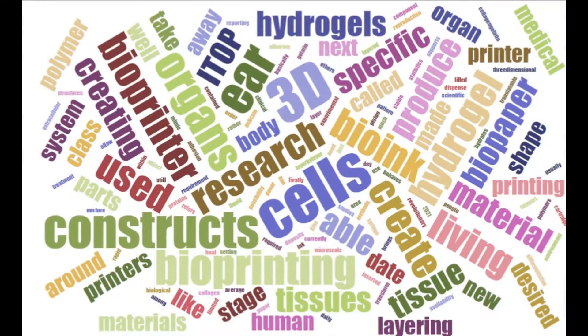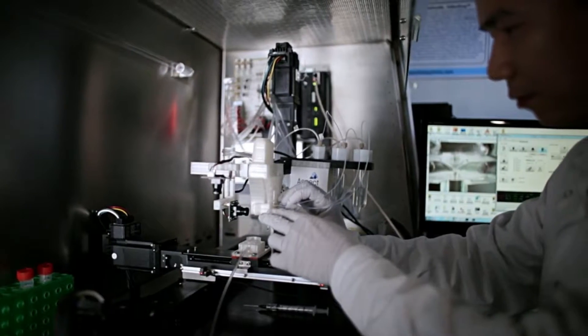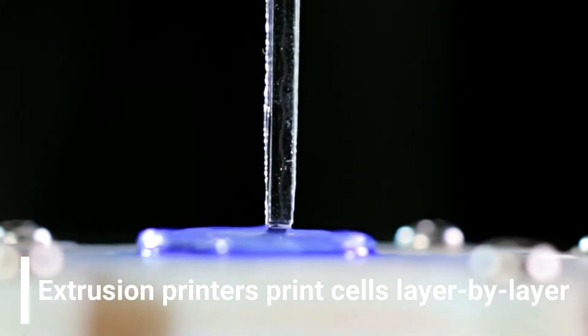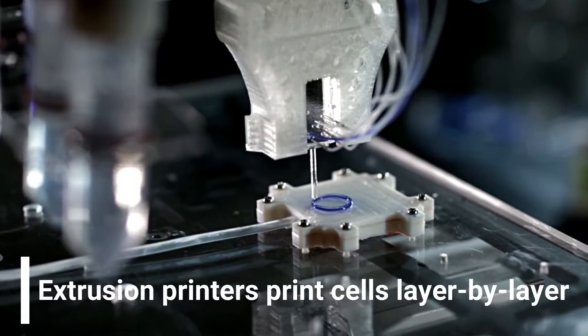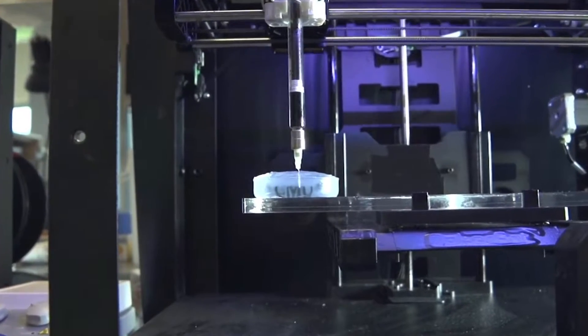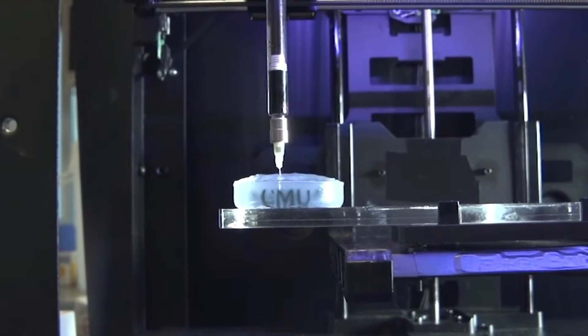There are three things that researchers need to be able to bioprint body parts. Firstly, a bioprinter is required. This is basically a 3D printer that deposits living cells in the desired pattern. A specific class, called extrusion printers, prints cells layer by layer, just like a 3D printer, to create 3D constructs. Extrusion methods use a syringe and a piston system to dispense material through micro-scale nozzles to produce stable 3D structures.